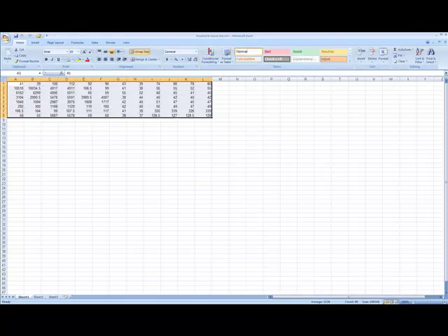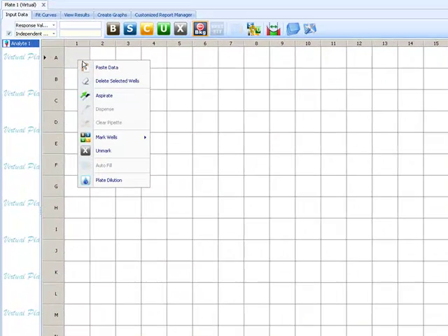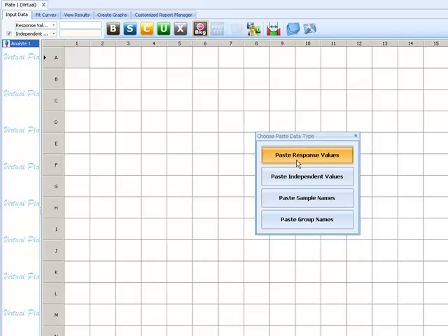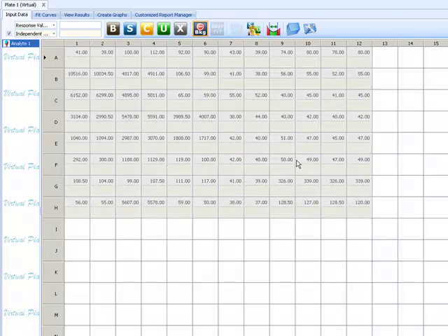I will start off by copying and pasting my raw data into ReaderFit. File importing is also supported for CSV, Excel, or text files.